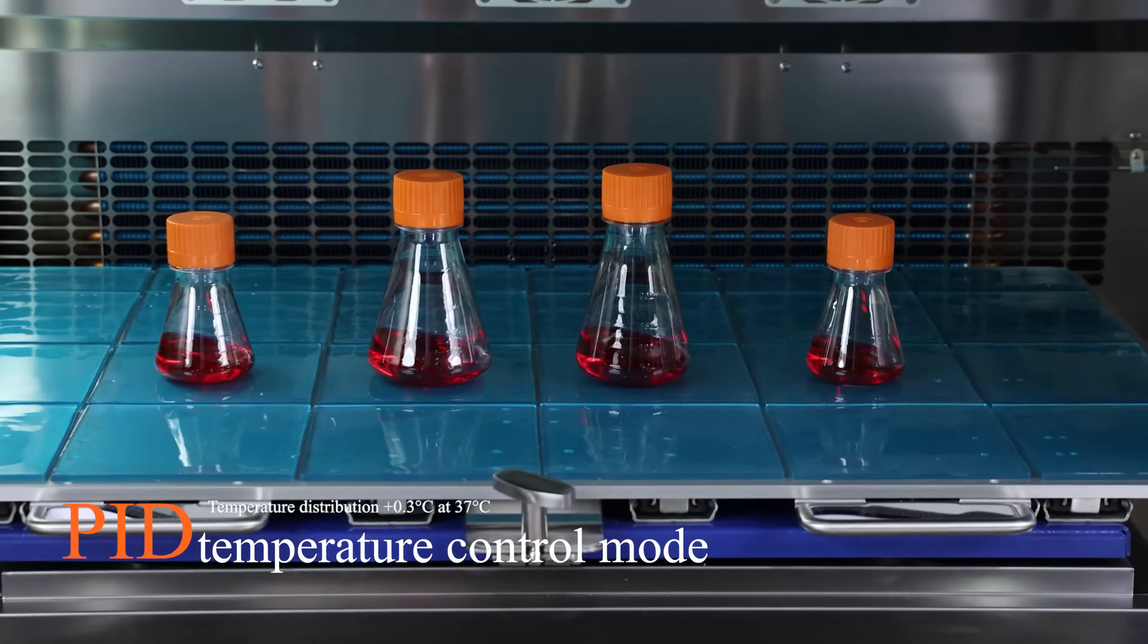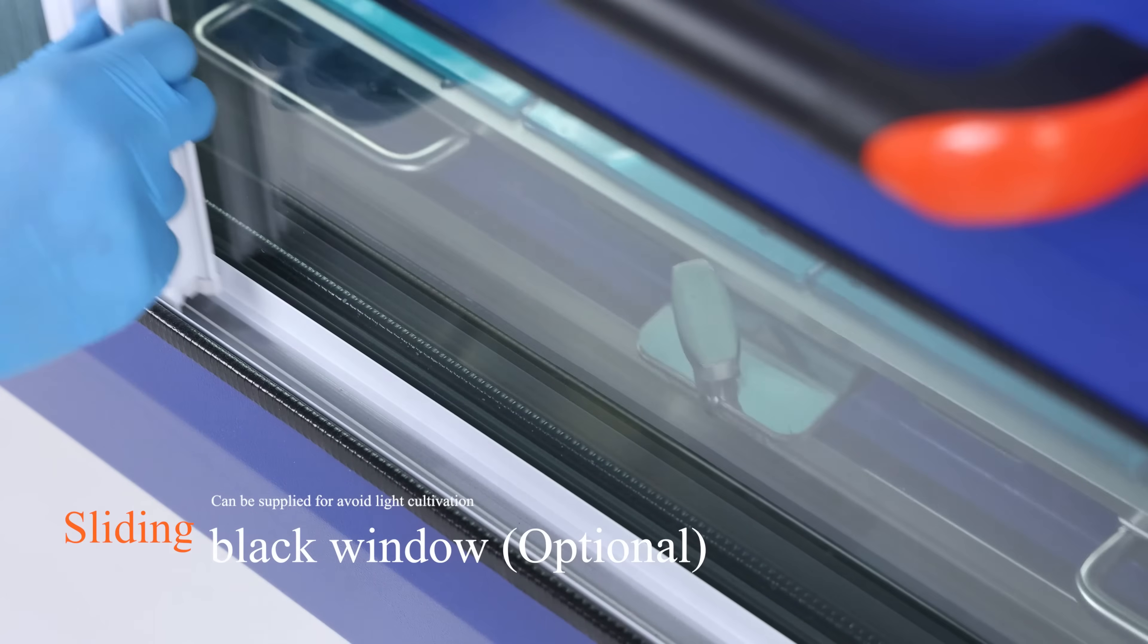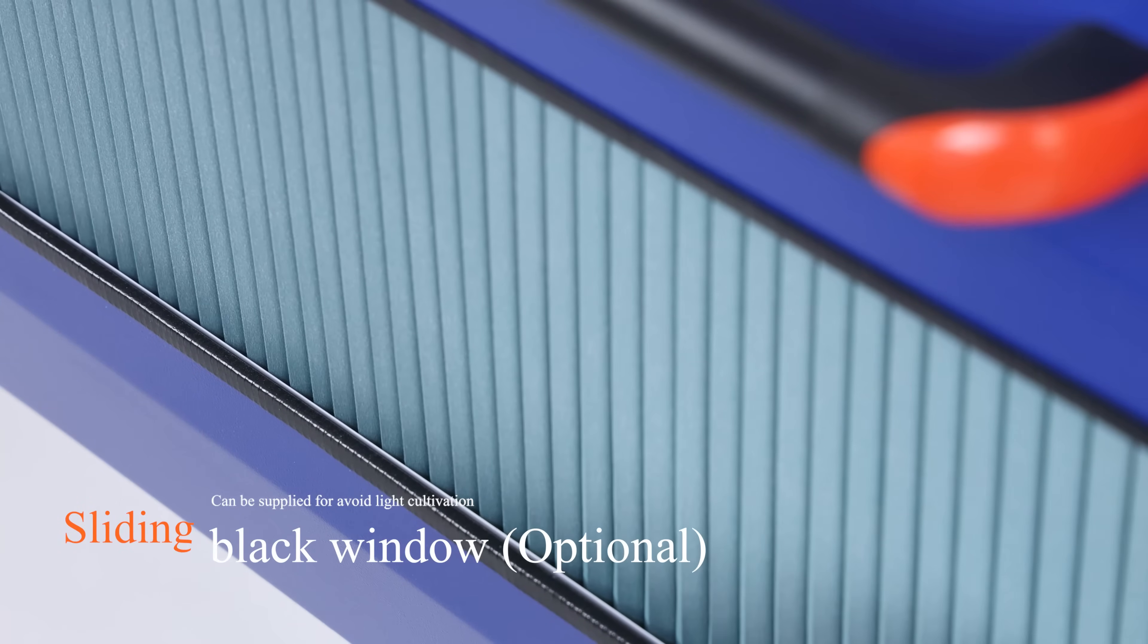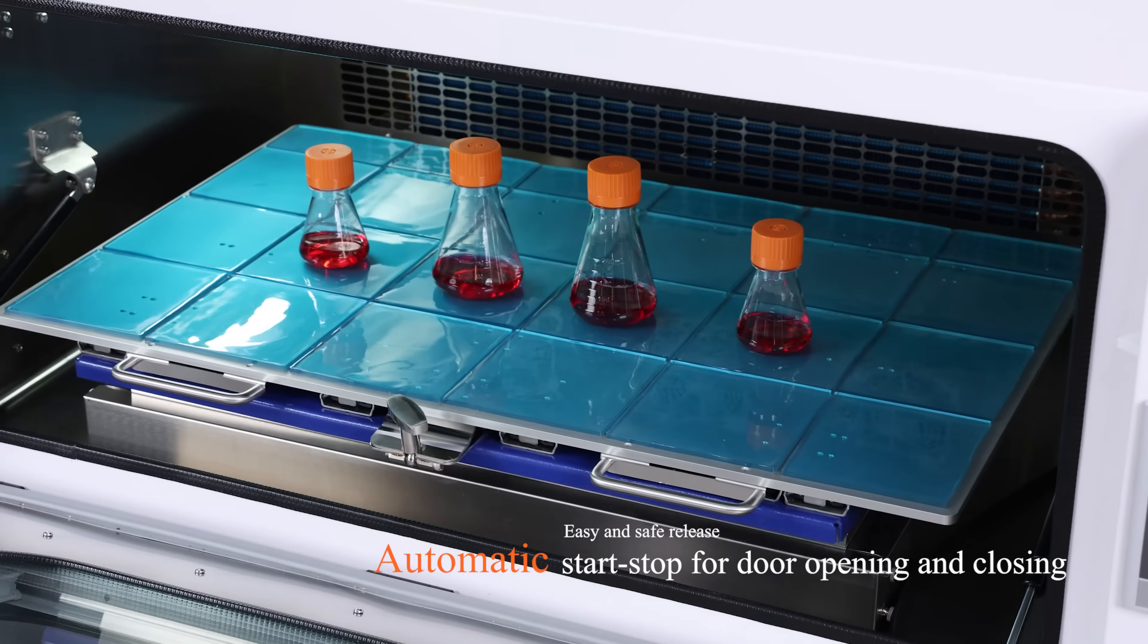High-precision temperature control mode, temperature distribution plus or minus 0.3°C at 37°C. Sliding black windows can be supplied for avoiding light cultivation. Automatic start-stop door opening and closing, easy and safe release.